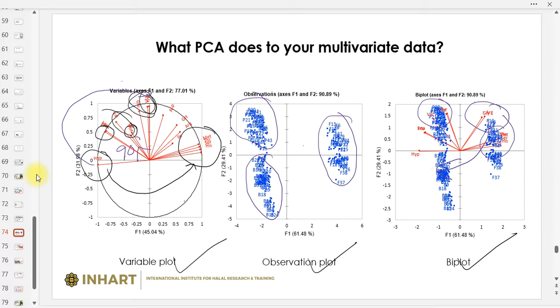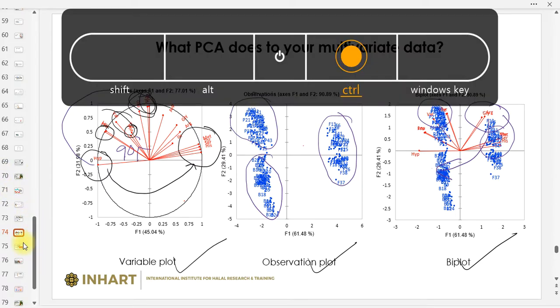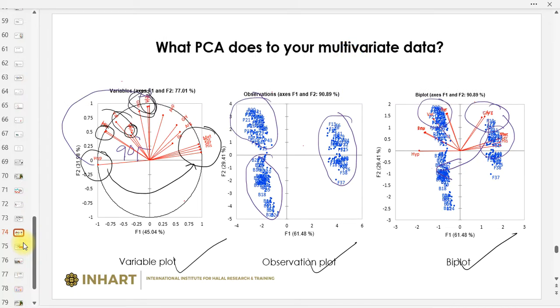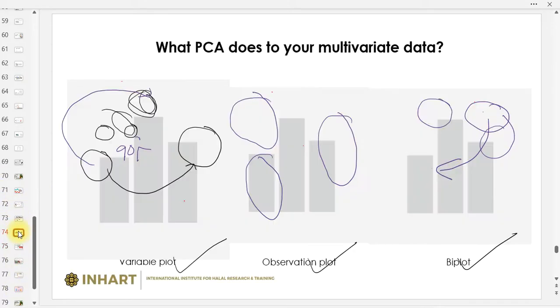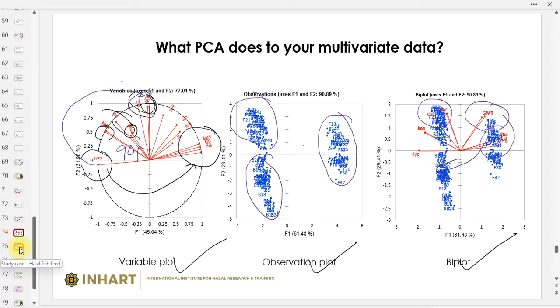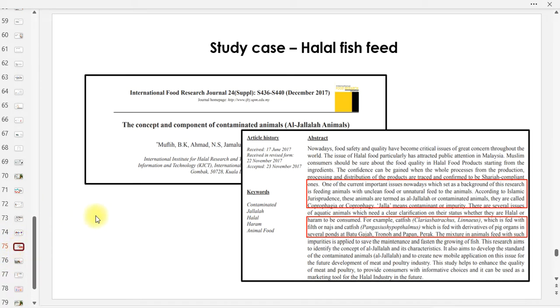Okay, 348. Tak buat lagi ni, hands on. Okay, so any button to open this one? Kejap lagi, kejap lagi. Belum sampai lagi. Nak balik sekejap.